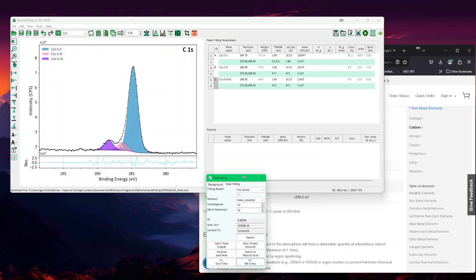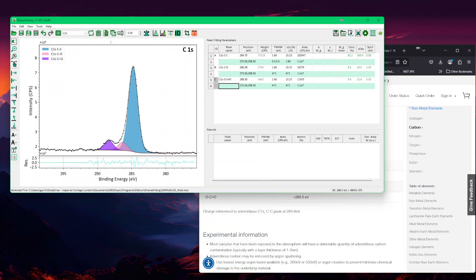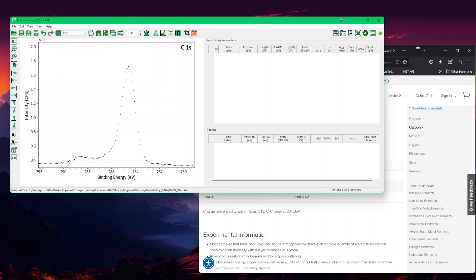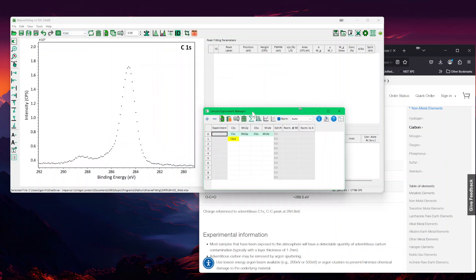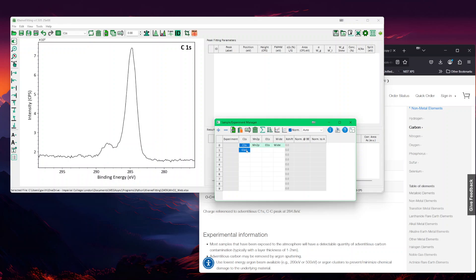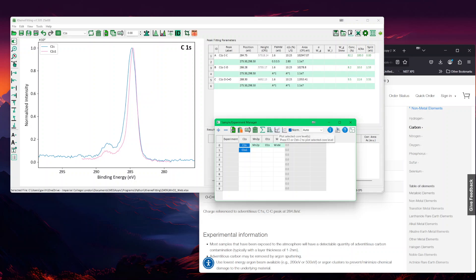The reason why we only see three peaks is I believe it is not well resolved. That's why I've included also another carbon 1S, which is slightly different. You may see that now, you may see more elongated. If you compare both samples, I'm going into the sample manager and you can then compare both things using this plot. Now you can see that actually the width of this pink one, the carbon 1S1, is slightly smaller. So now you have a better resolution in this level here. We can try again using this three peak model.